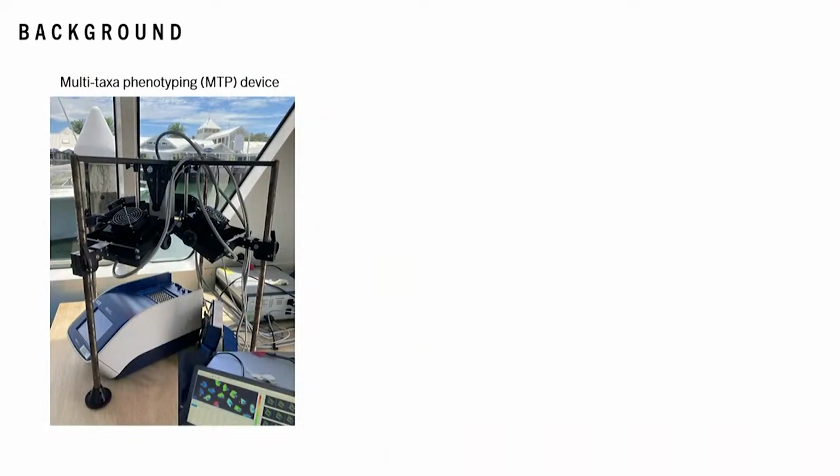Recently, our lab group at UTS, at Future Reefs, have developed a high-throughput multi-taxa phenotyping device, which I'm just going to refer to from now on as the MTP device, which allows for rapid in-field assessment of coral phenotypes under multiple stressors. So this includes factors such as temperature, light, and nutrients.